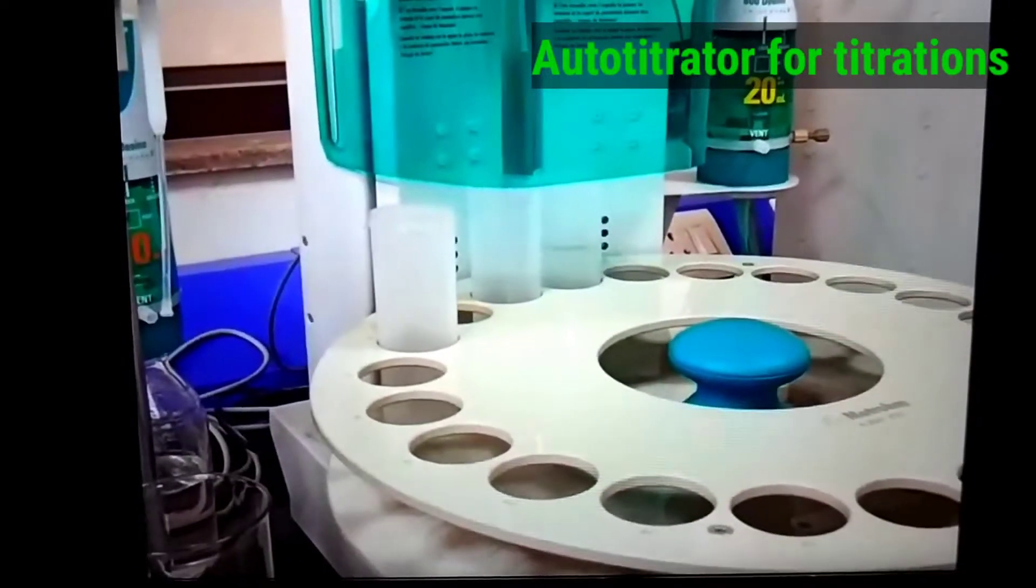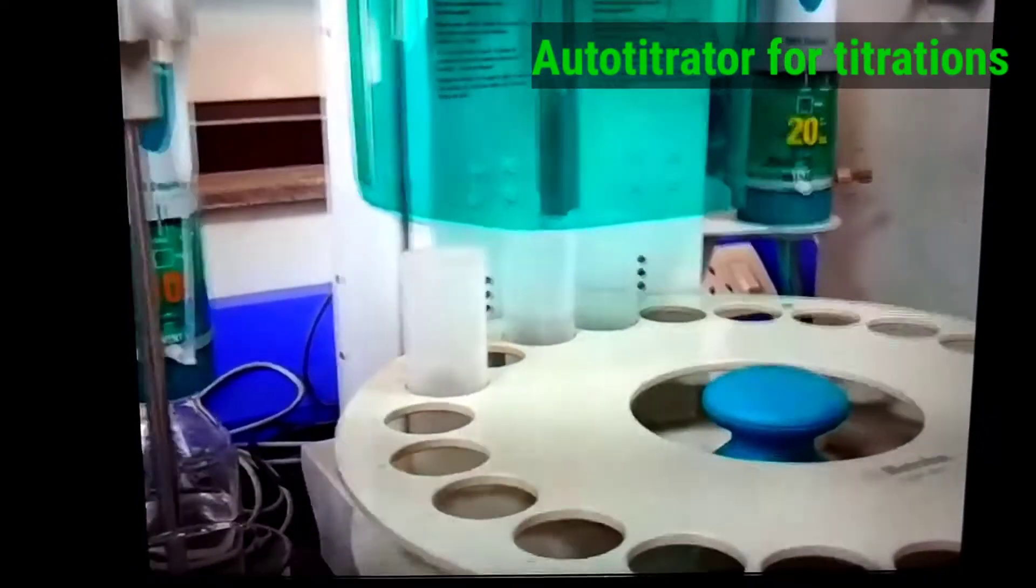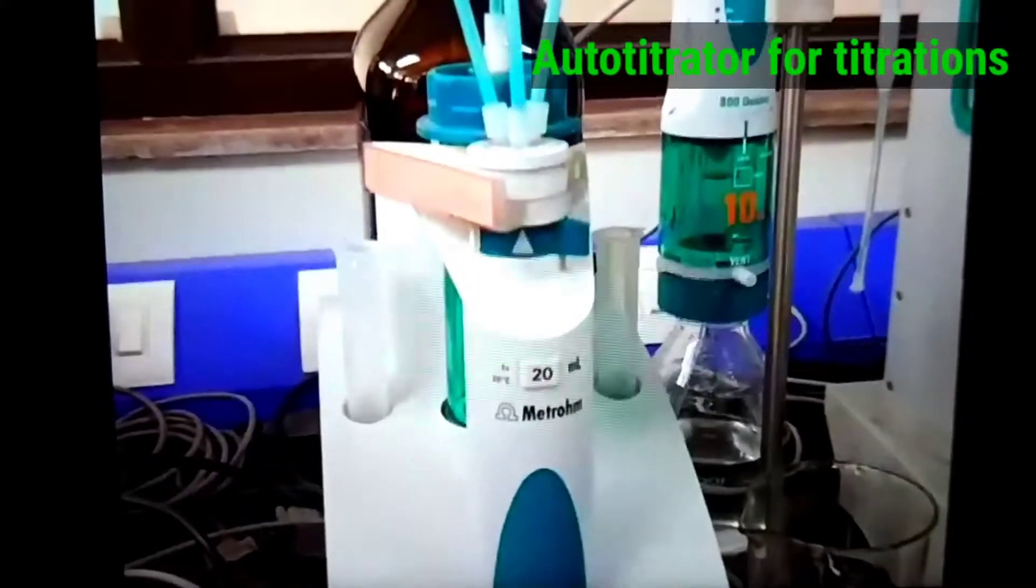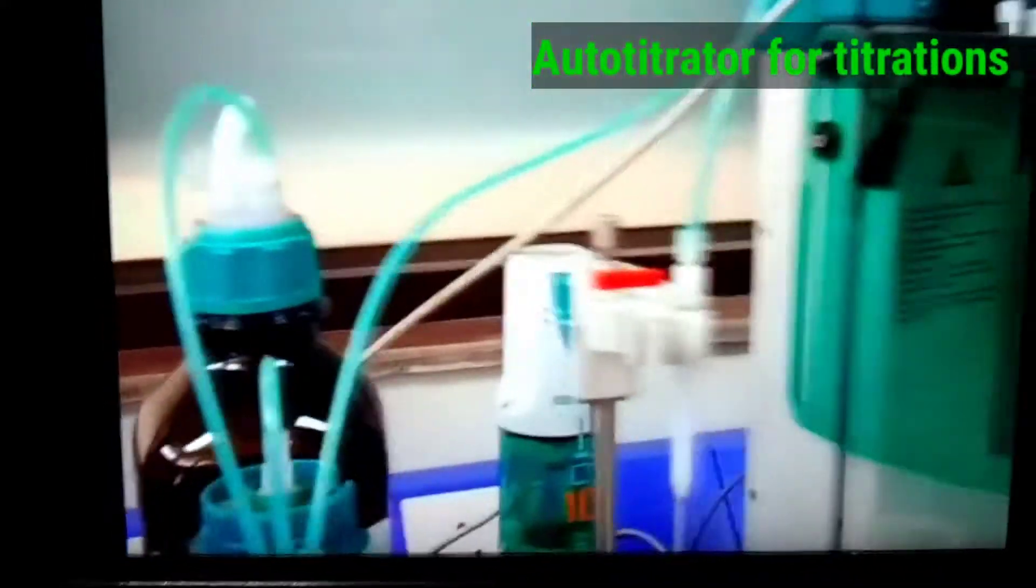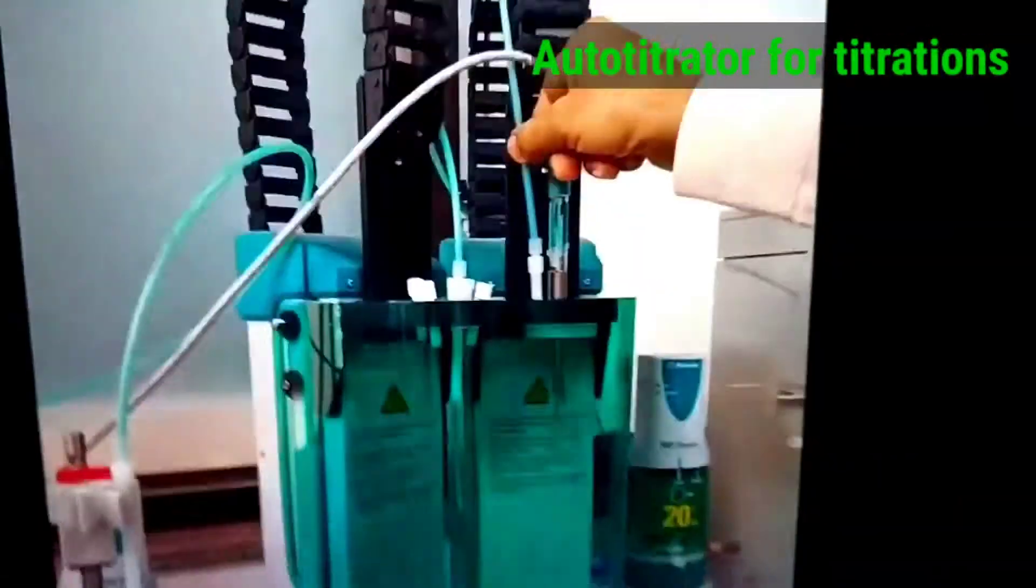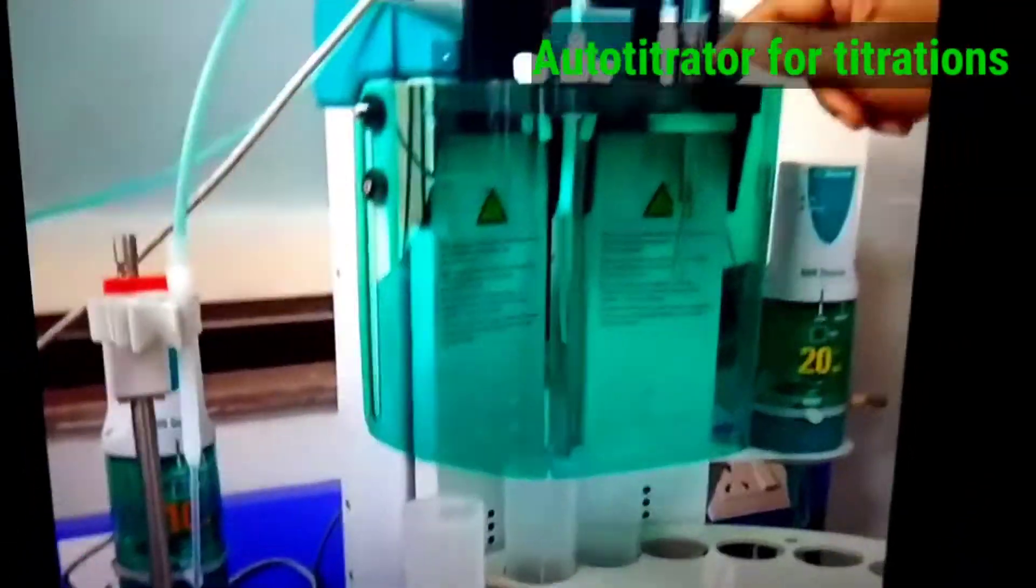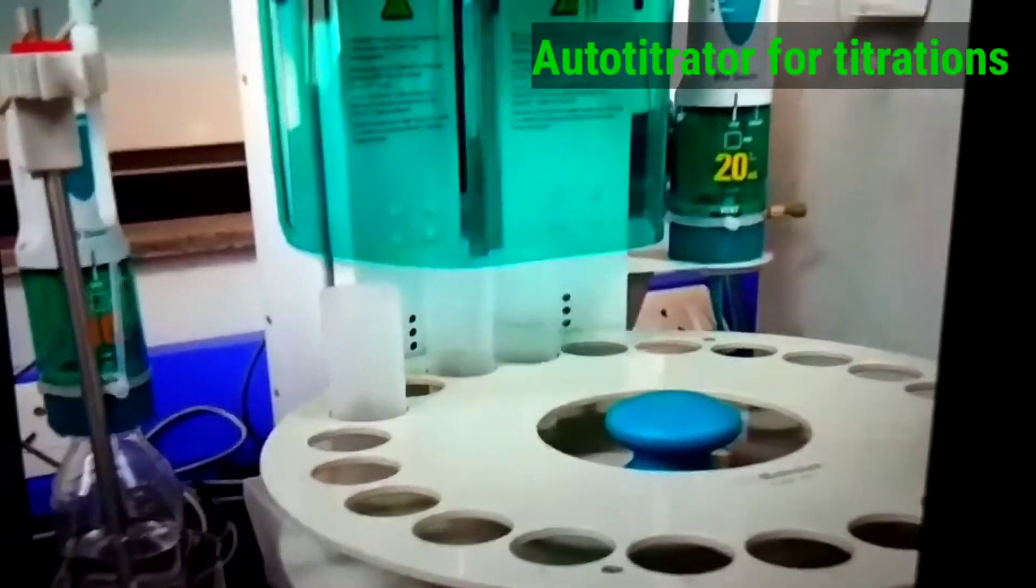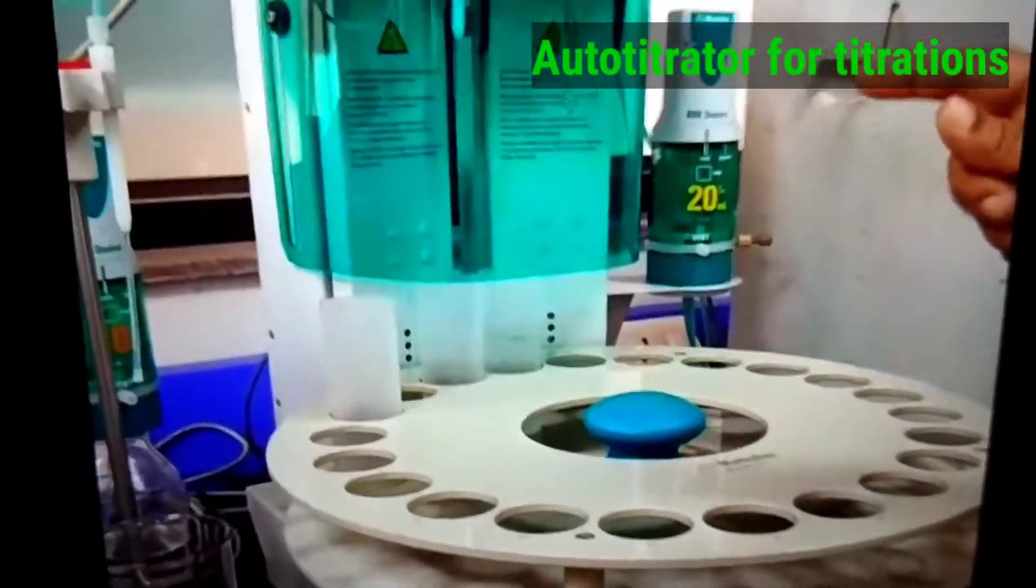Then what will happen? This acid is coming drop by drop, and it will be added into the sample through these tubes. So drop by drop this acid will be added into that one. Then the pH of this water sample will change.